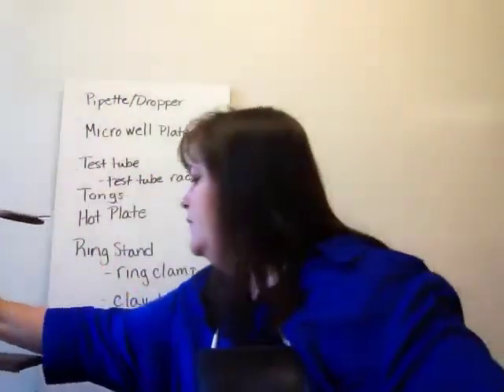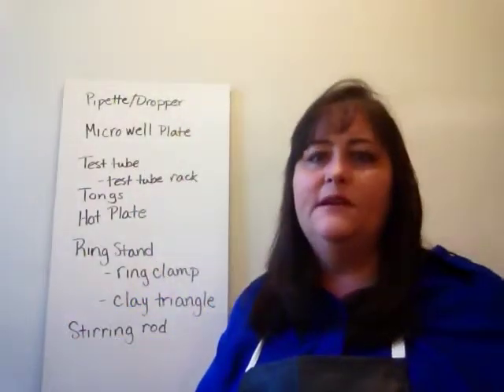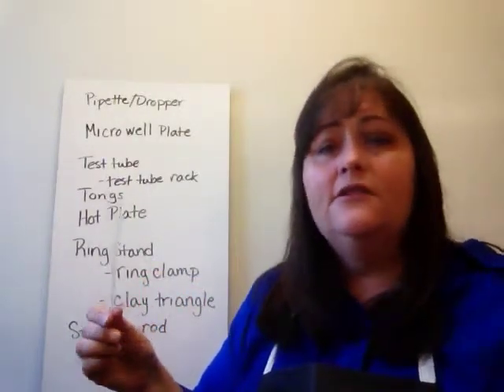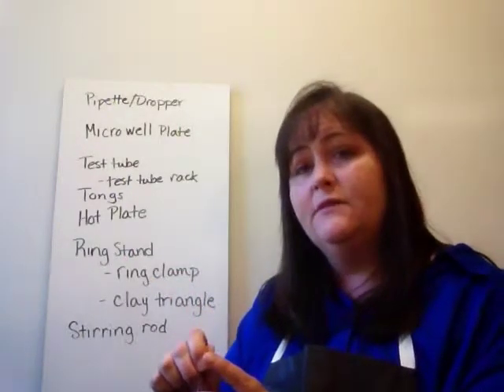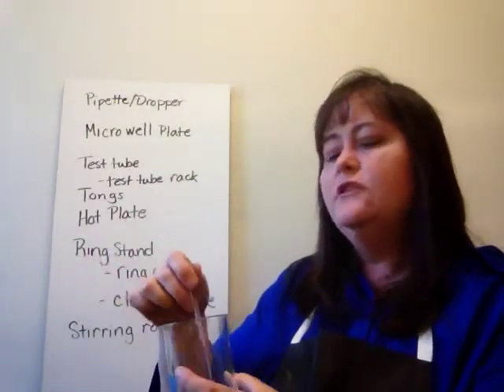The next thing we're going to talk about is the stirring rod. And the stirring rod looks like it might just be a piece of plastic. It's really thick and it's pretty see-through. And you might think that you just stir with it and that's no big deal. But sometimes you use it to move items around or crush some small items, small chemicals, so that they have more surface area. But usually you do use it to stir it.